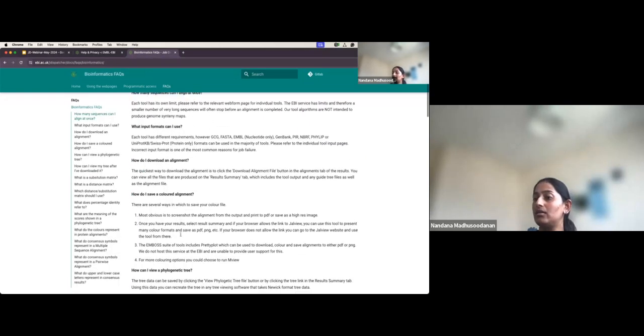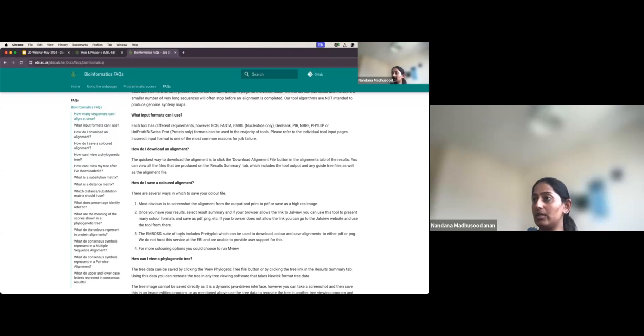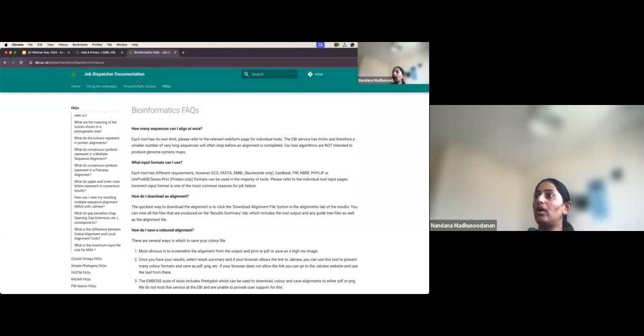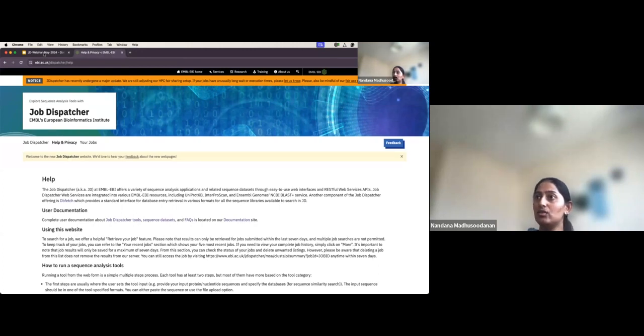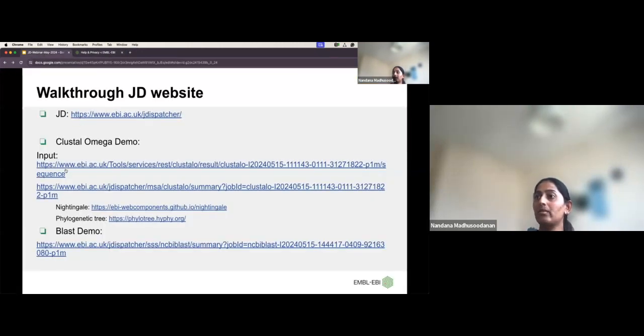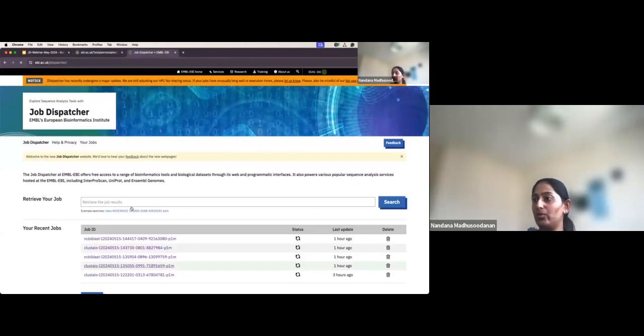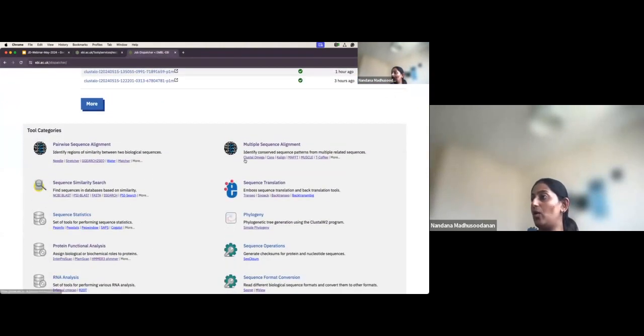There are frequently asked questions in general and also tool related. If you come here, you can see tool specific FAQs are also available. So that's all about our documentation.